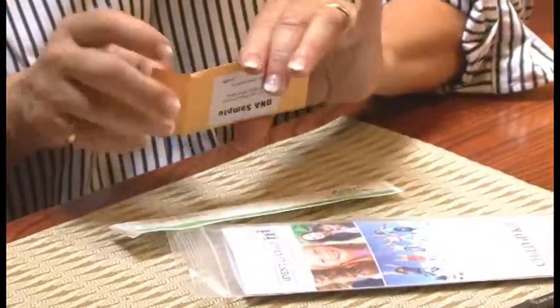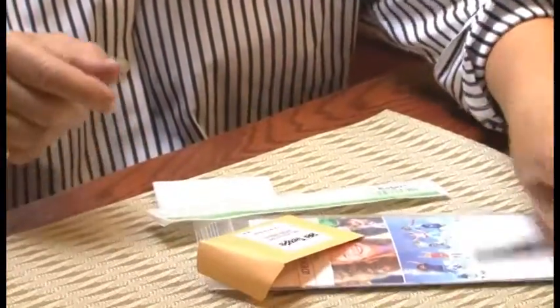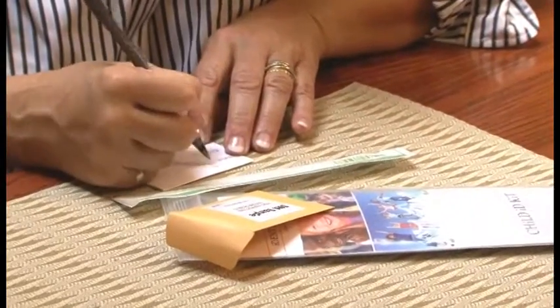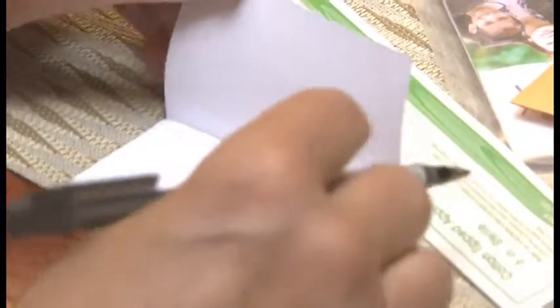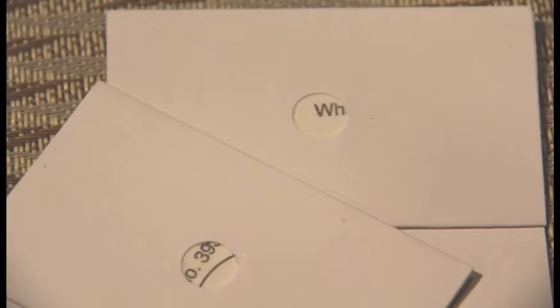Remove the FTA card from the envelope and write your child's name and today's date on the front of the card. Open the flap of the card to expose the small circle containing the white FTA paper. Be extremely careful not to touch the FTA paper, as doing so will contaminate the sample. Some of the FTA papers might contain letters or numbers and will not affect the collected buccal cells.